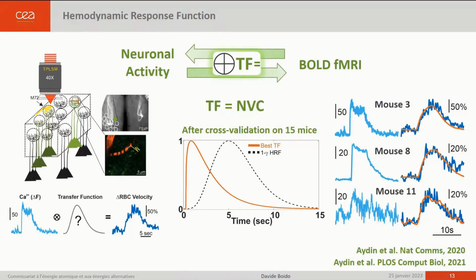Our best hemodynamic response function not only performs well on its own dataset, but it faithfully predicts the vascular responses on the other mice data, given the neuronal responses. And on the right, you have 3 examples. Now I have no time, unfortunately, to show you how surprisingly robust we demonstrated this microscopic HRF is. We tested it on different modulations of odor stimulus and also across brain states comprising wakefulness, always getting good predictions. Please refer to the citation for this information.